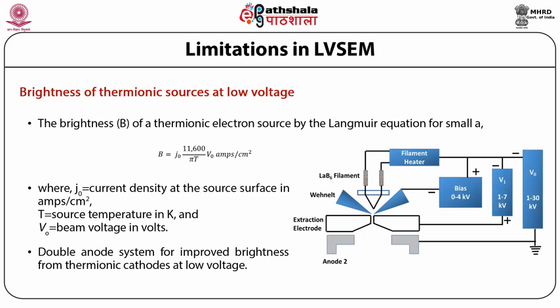actually obtained is even lower than the value estimated from equation 1, because this equation is only valid in the absence of space charges near the cathode surface.